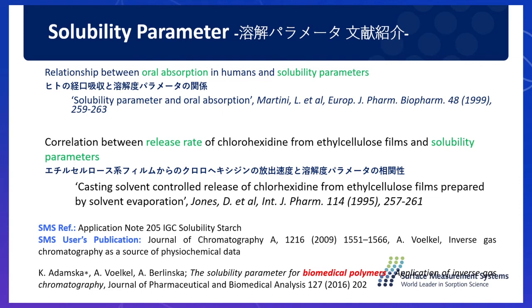There's a very nice publication from one of our customers which determines the solubility parameters of biomedical polymers, and the reference is on this slide on the bottom.